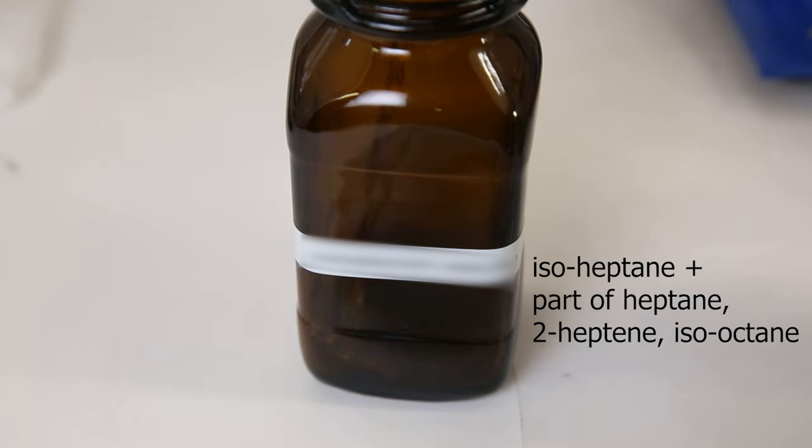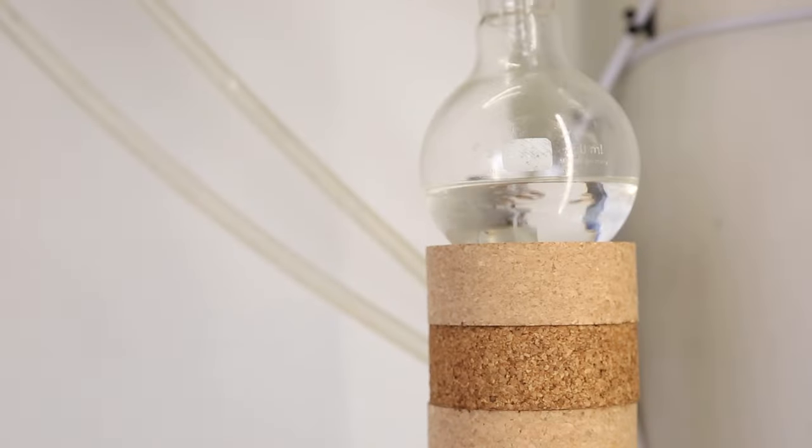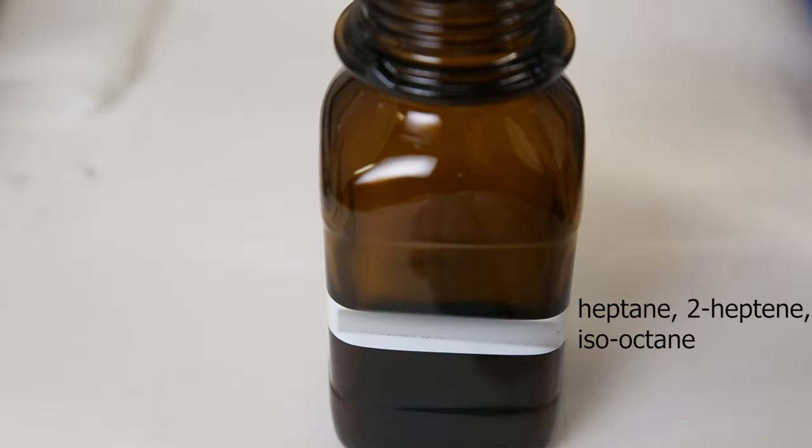I removed the flask to collect the fraction, but I left it a little too long at this temperature, so it is slightly overlapping with the next fraction. But I will redistill it afterward to get better separation. I left it going for longer so everything around 96°C could come over, and I put it into a new bottle as a new fraction.